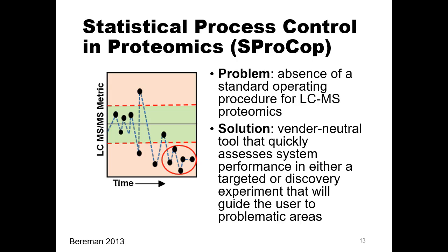There was just word of mouth, like, oh, this lab makes really high quality mass spectrometry data sets, or, oh, this lab has kind of sketchy mass spectrometry data sets, but there was no metric to measure the quality of a mass spectrometry data set. So the idea he had was this vendor-neutral tool that would quickly assess how well an LC-MS system was performing.